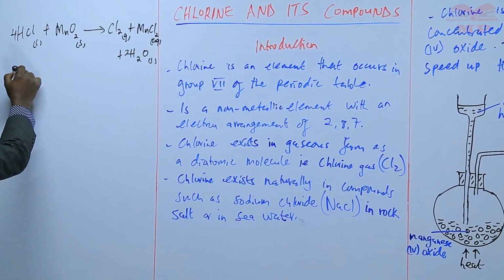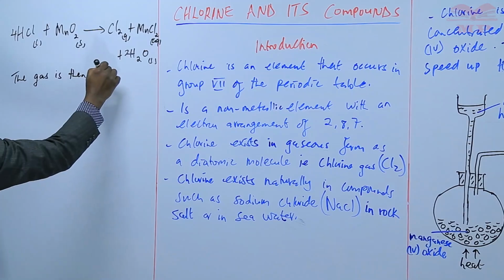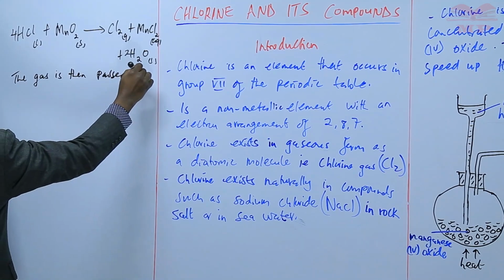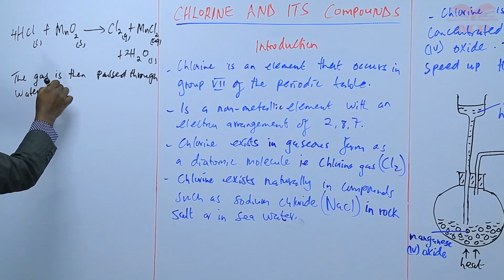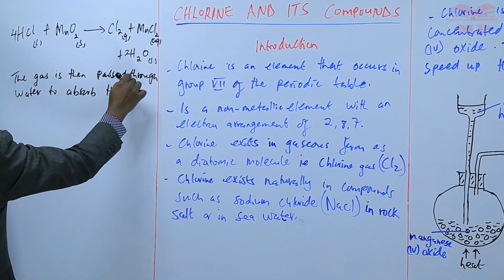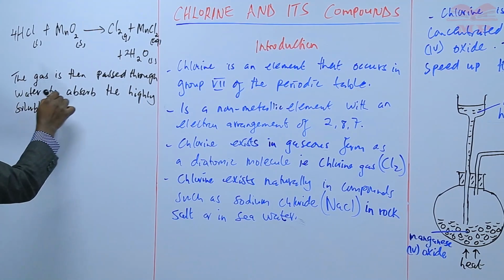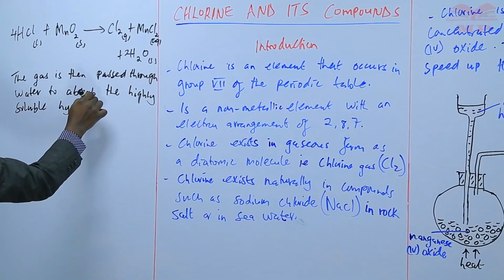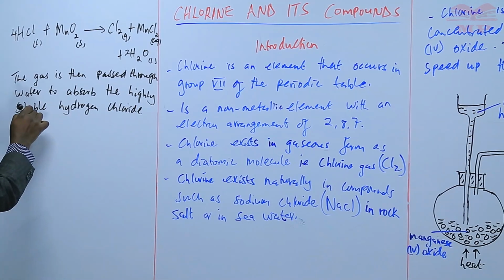So we are saying that the gas is then passed through water to absorb the highly soluble hydrogen chloride gas, which is an impurity.